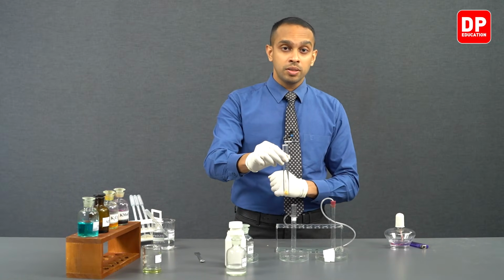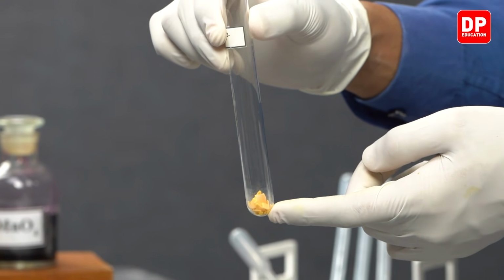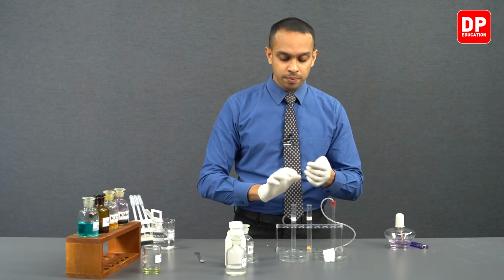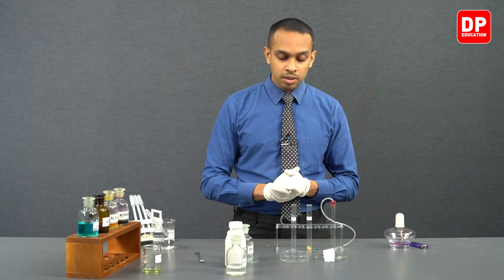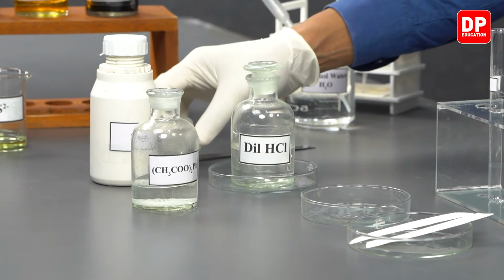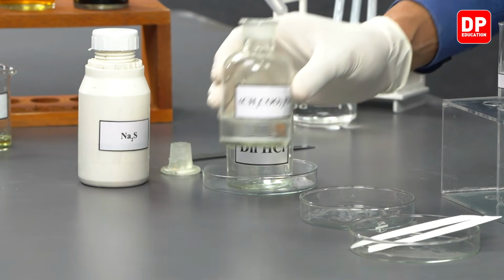We have taken some solid sodium sulfide here, and we are going to leave it aside for the time being. Afterwards, we will take a small amount of lead acetate. We can pour a small amount of lead acetate onto a petri dish here.